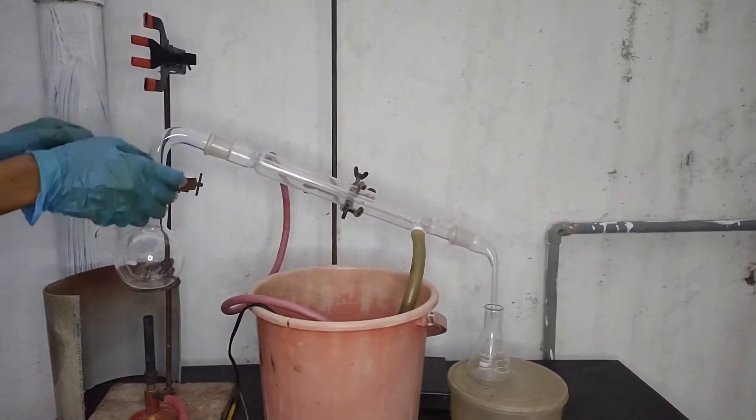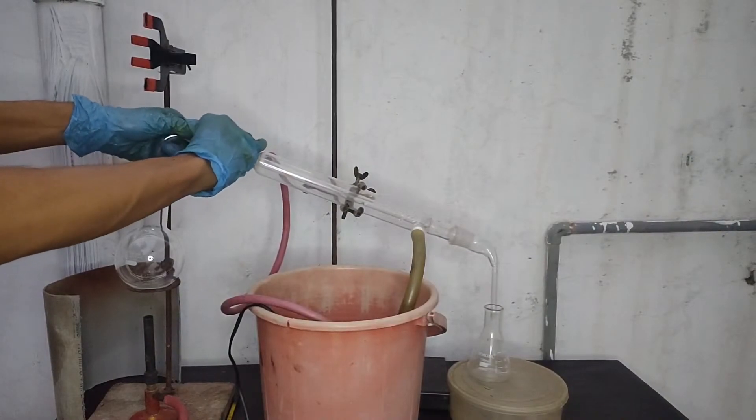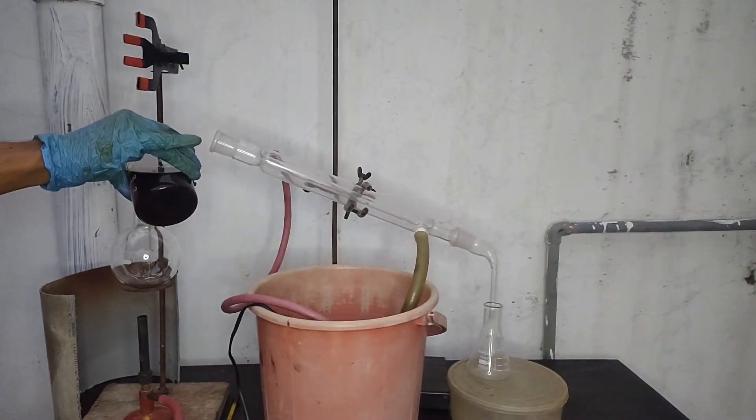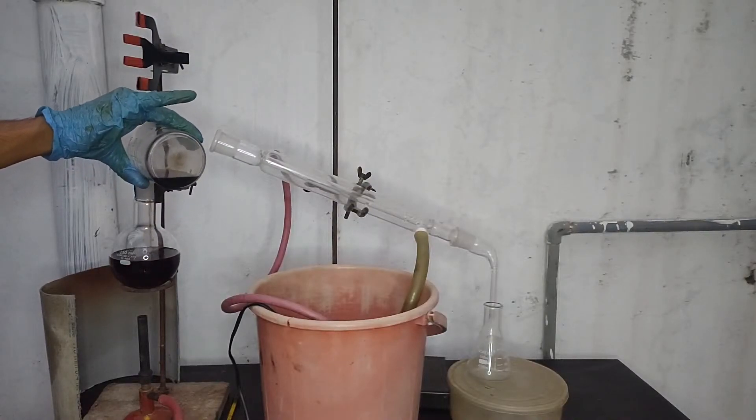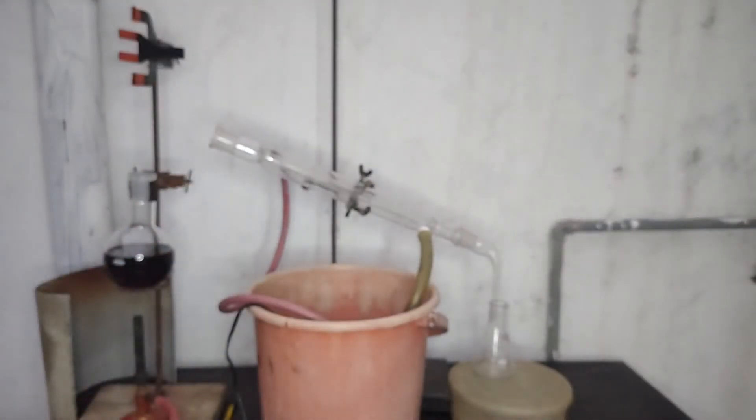A distillation setup was set up and 200 ml of drain cleaner was added to a 250 ml round bottom flask. To the boiling flask I added some porcelain chips which will reduce bumping and favor smooth boiling.